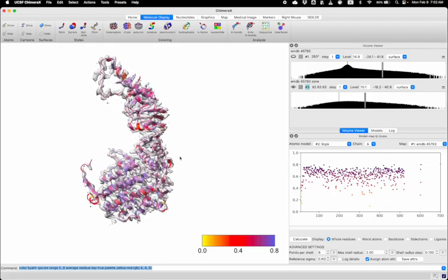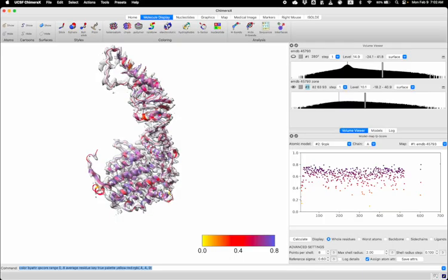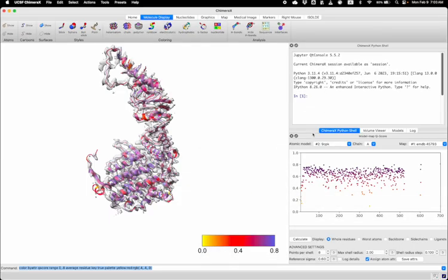Okay, in the exercise that we will do for the class, we will export these Q scores to a file and then do some statistics on them. To do this, I will use a script. In ChimeraX, I can open the general shell. This is basically a Python shell where I can run scripts, and this will help me to export the Q scores. I will provide the scripts as a separate file, or it's in the assignment step-by-step guide. Basically, I just enter it here.